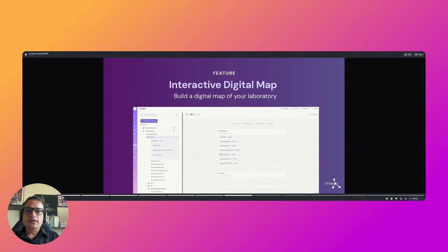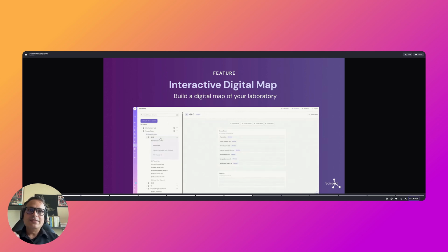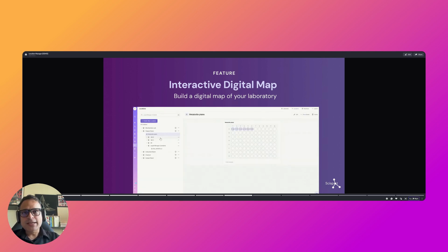And it also has a capability not just to search and retrieve your samples, but also to store samples in a smart way. So, for instance, if I'm running a sample for a particular test and that sample fails, it has that metadata, it has that chain of custody. If that sample passes and I need to maintain that trail of how the sample moved from plate to plate, it has that intelligence as well using AI. So you can go from room to freezer to shelf to rack to box in under 30 seconds.